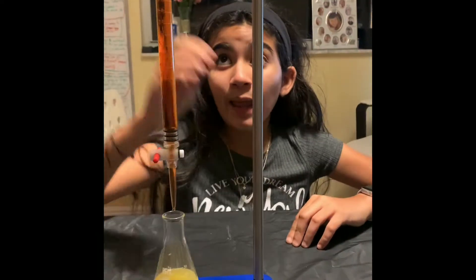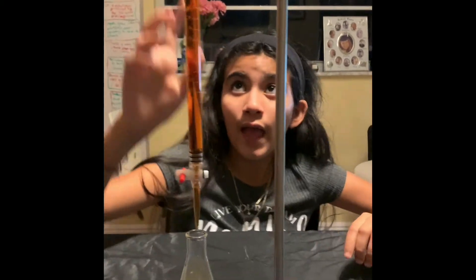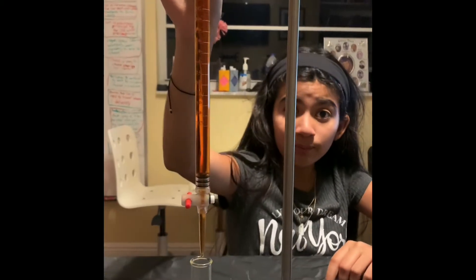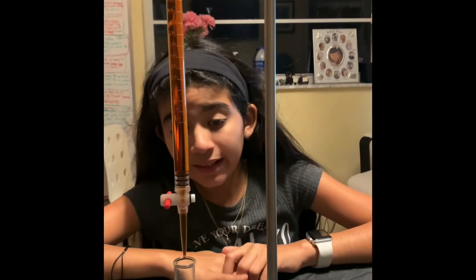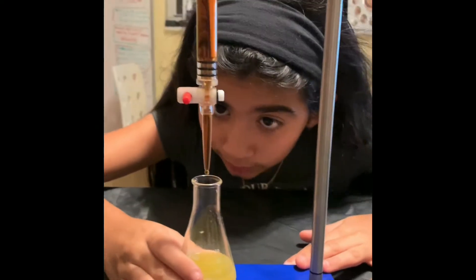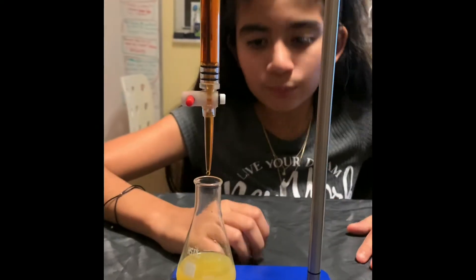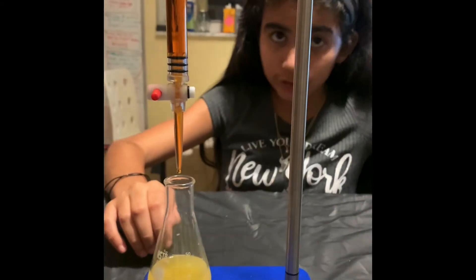So now I have my burette that I filled with iodine solution, and I will record the starting point of the iodine and later the ending point. So after I recorded it, I am going to put the iodine into our vitamin C with starch solution.